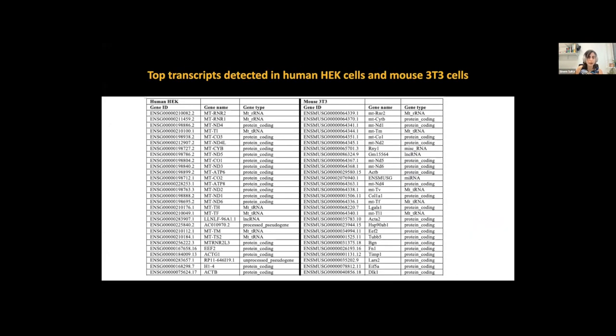It also gave us a number of different transcripts that are enriched for different cell types. In this case, we are not just using the poly A tail, but internal priming. So we don't only have mRNAs, but also things like microRNAs and long non-coding RNAs. So a lot of different varieties, which can be really transcriptome wide in this case. That's also an additional advantage of the approach.